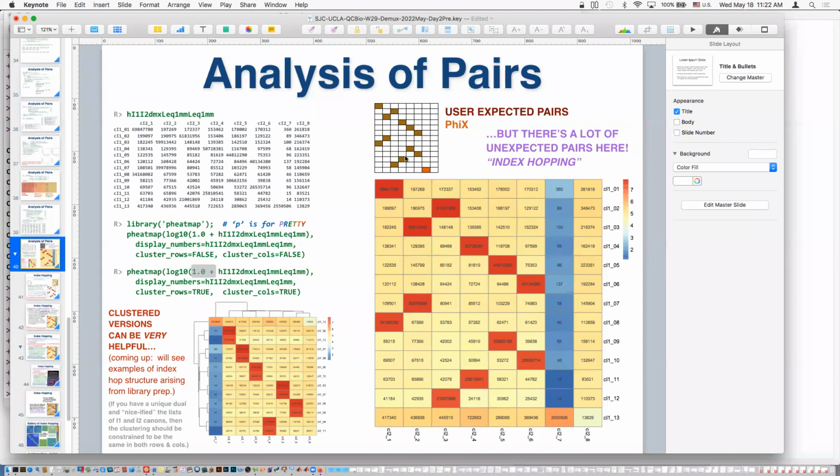But of course, these squares out here are zeros, getting things like 50,000, 100,000, 200,000. These squares are like 50 millions, probably getting about the same or something. Whatever. So the percent doesn't look bad, or at least it's not crazy. Right? We want to compute the number, which is what.